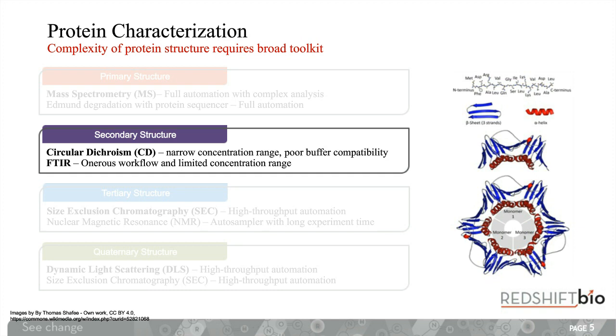It also suffers from a number of other problems, one of which is concentration. We're limited in circular dichroism to a maximum for a desktop system of about 1 milligram per mil concentration, which is usually quite a long way below what would be needed to look at these samples in situ, particularly in their formulation conditions. And it also suffers from poor compatibility with the background.